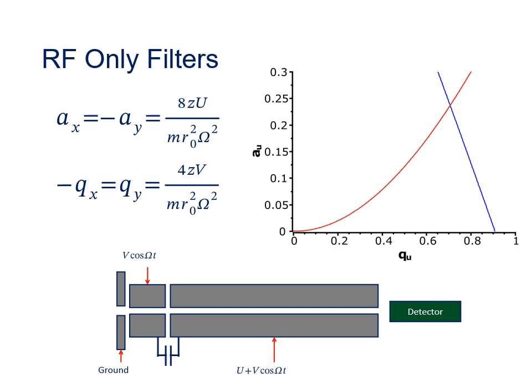So let's look and see how this Brubaker filter will stop the ion going through the unstable region of the stability diagram as it enters the quadrupole. So let's look at what voltages this ion sees as it moves from its original black position, through the blue position in the Brubaker filter, to the red position where it's seeing the full quadrupole potentials. Just like in the earlier example, when the ion is in the middle of the orifice in the ground plate, it sees 0 DC offset and 0 RF amplitude, so it plots at an A and Q of 0 at the origin of the stability diagram.